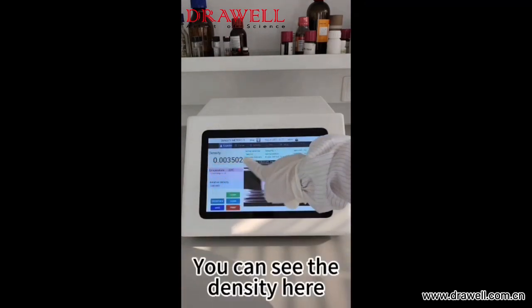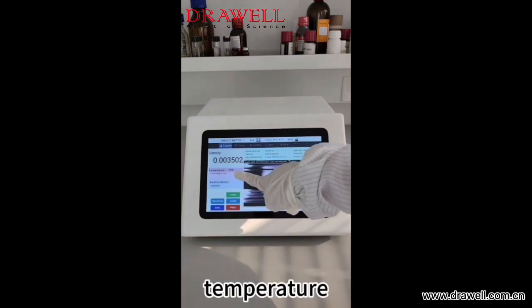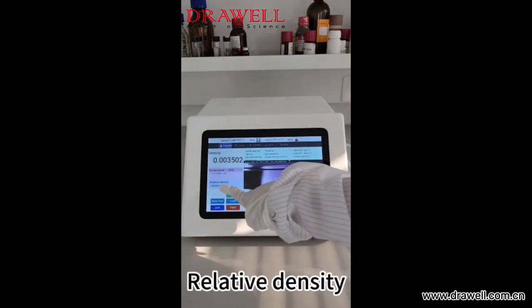You can see the density here, as well as the temperature and relative density.